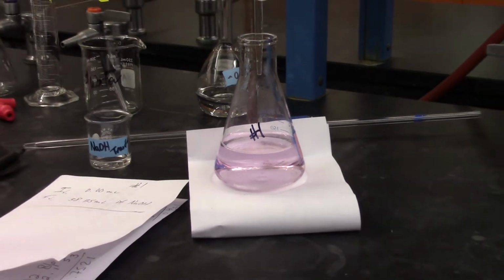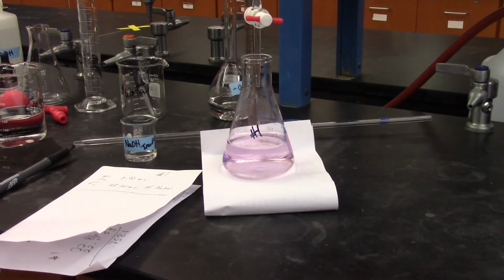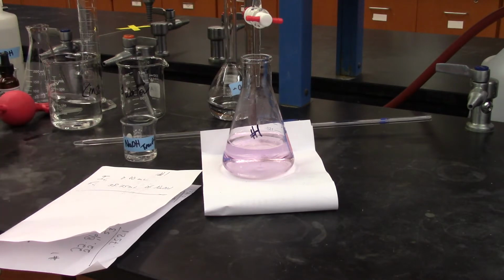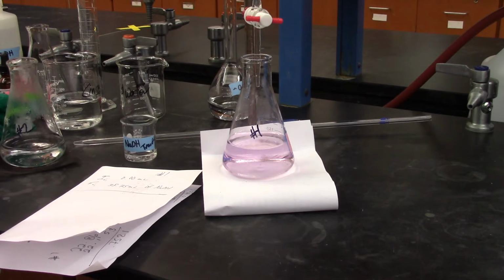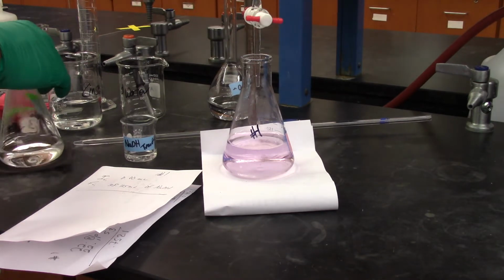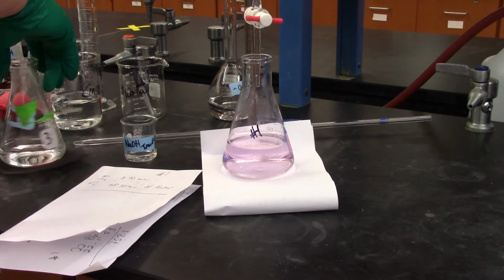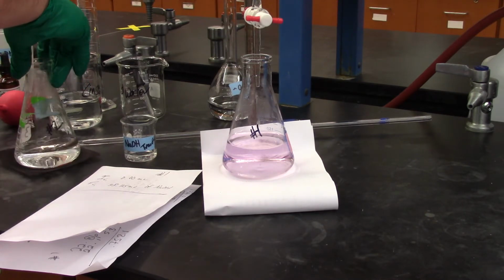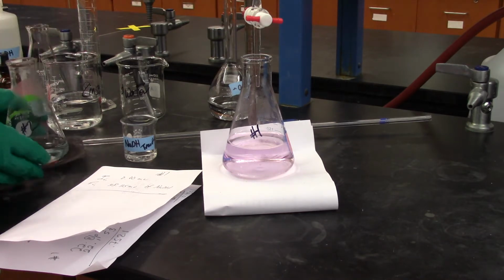Better thought, we should probably talk about breaking this down and setting up your next reaction. So when you're switching these out, you're going to want to have your second titration flask on deck. Mine was heating, so I'm going to put it on my wire mesh just to make sure it doesn't crack on the cold bench. Rinsing down anything that may have been lingering.